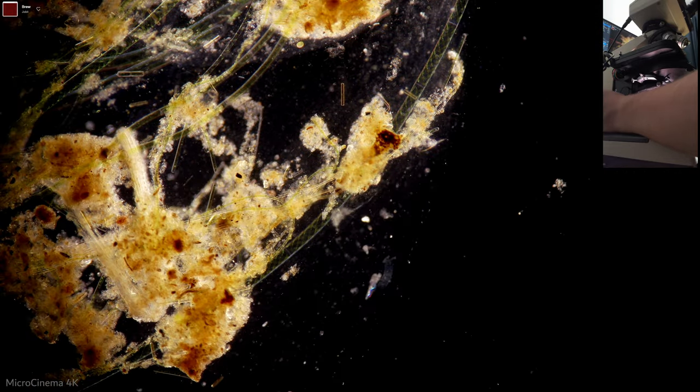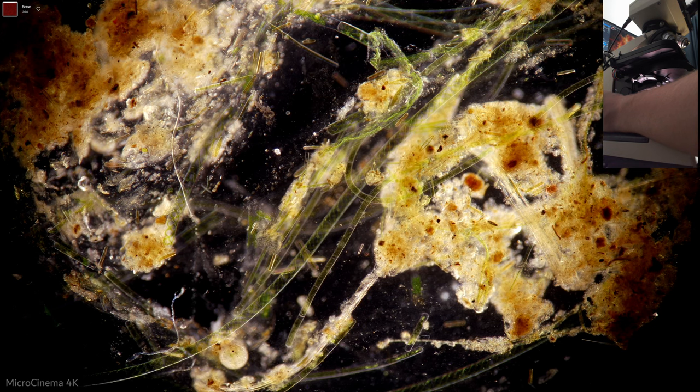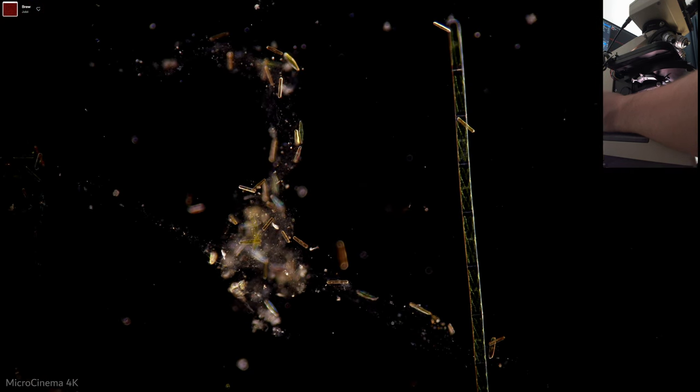And dark field obviously is just one of the most striking things that you can do with a microscope. I get some wonderful results.